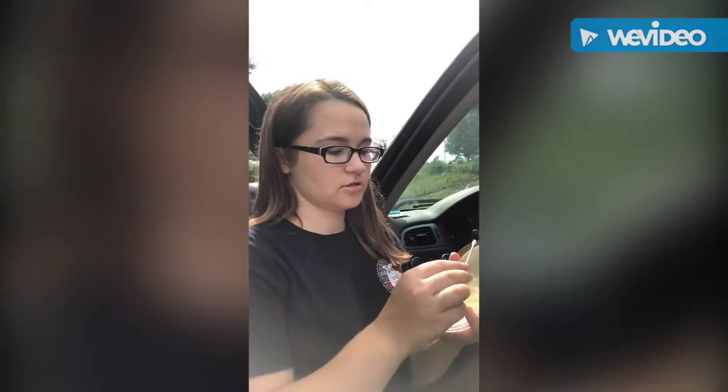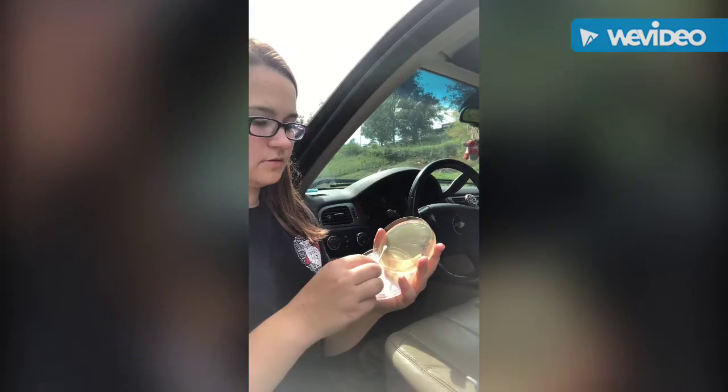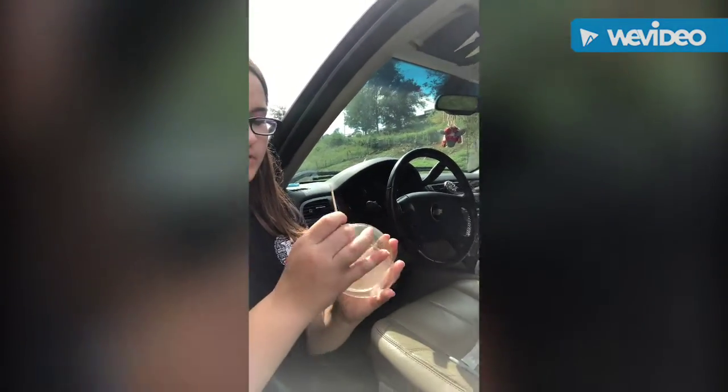Okay, right. Now I am going to swab my mouth. We're getting a cotton swab. Okay, hold that right there. There we go. So now I am going to get my Petri dish. Alrighty. Now that I have swabbed the animals, the following video clips are of the Petri dishes with the bacteria growth and the dates that I took the video with.